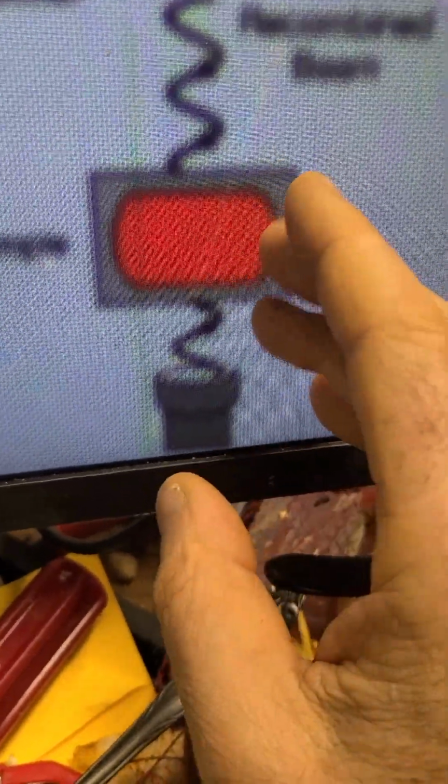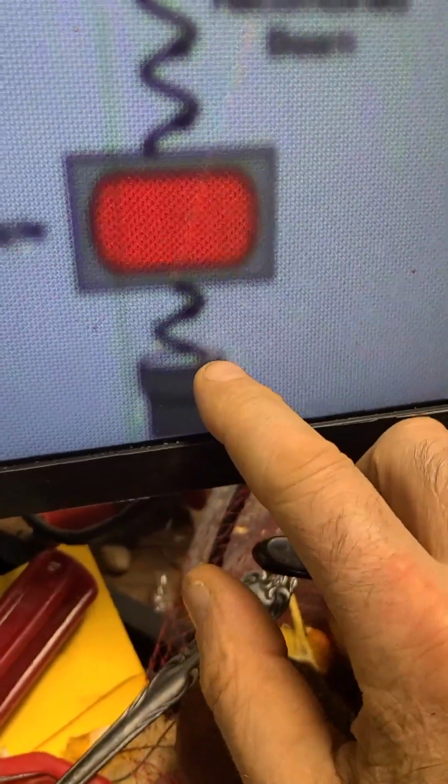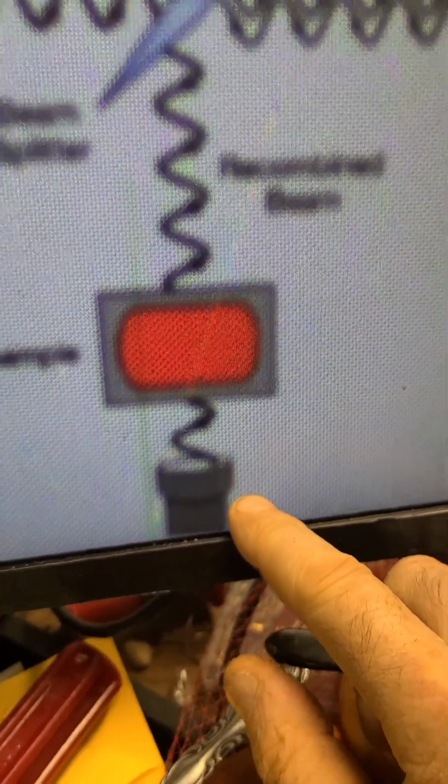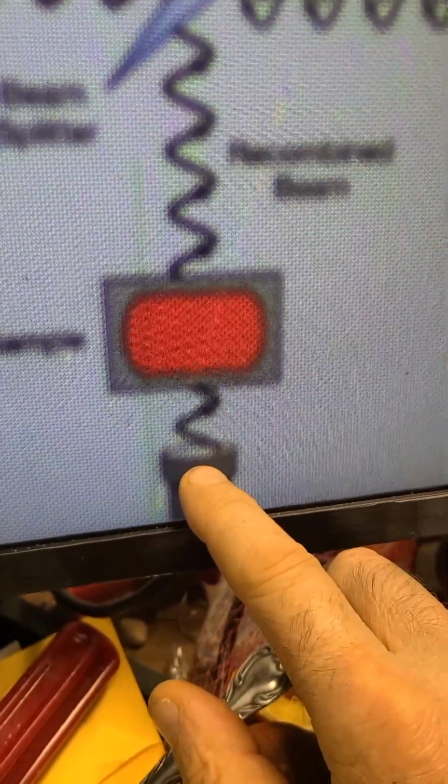And then let's take away the sample, right? As it'll hit the sample, or if we take it away, it'll hit the detector at a certain spot. So light from one spot on our emitter compared to a second spot will be focused back together on the first and second spot on the detector.